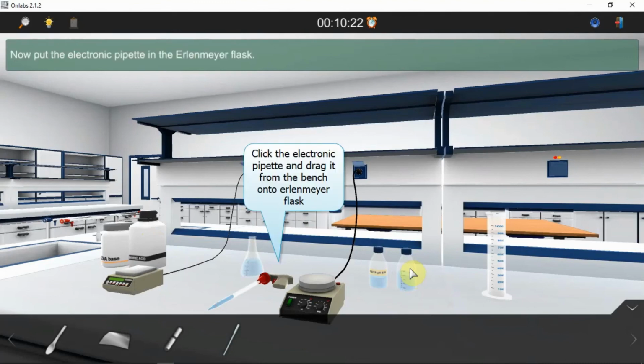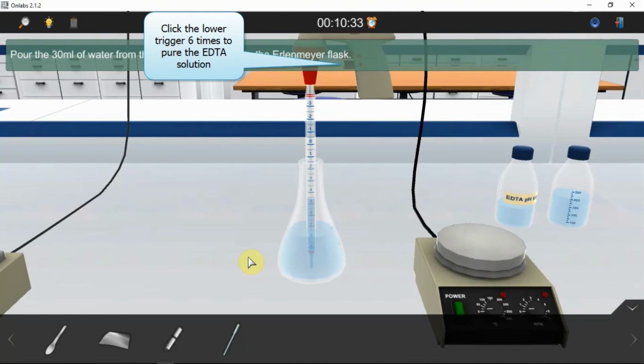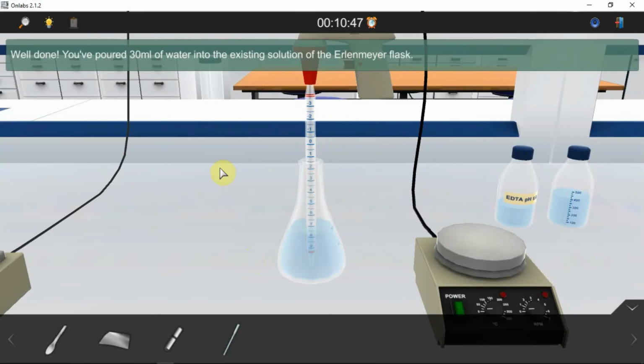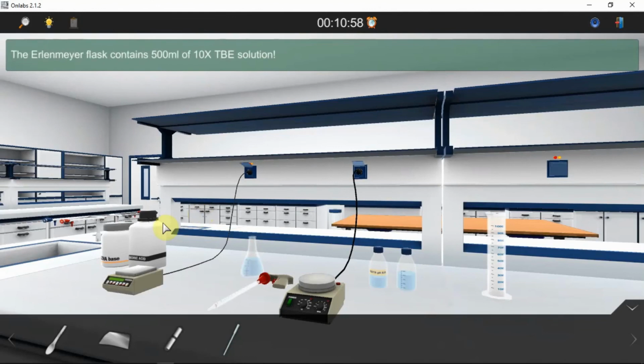Well done. Now put the electronic pipette in the Erlenmeyer flask. Well done. Pour the 30 ml of water from the electronic pipette into the Erlenmeyer flask. Well done. You've poured 30 ml of water into the existing solution of the Erlenmeyer flask. Remove the electronic pipette from the Erlenmeyer flask. Congratulations! The Erlenmeyer flask contains 500 ml of 10 times TBE solution.